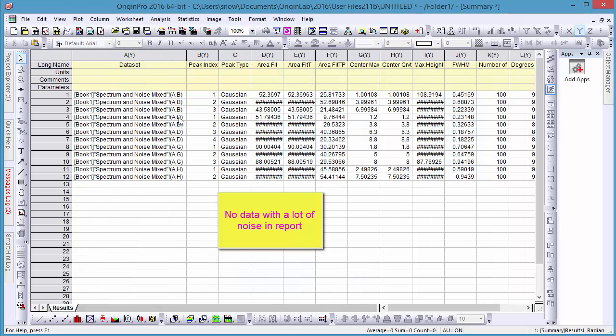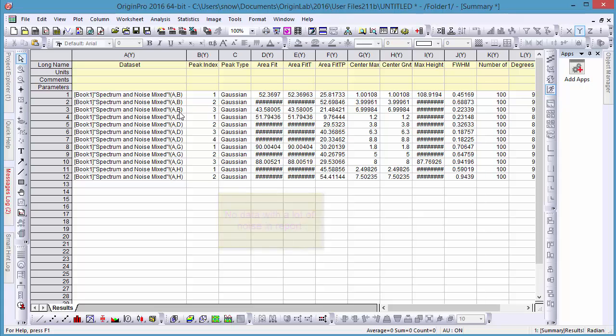And these are just a couple of the ways that Origin 2016 can utilize scripts in batch processing.